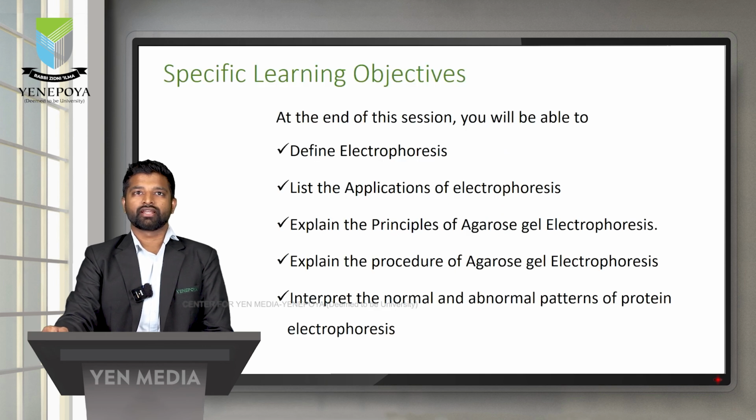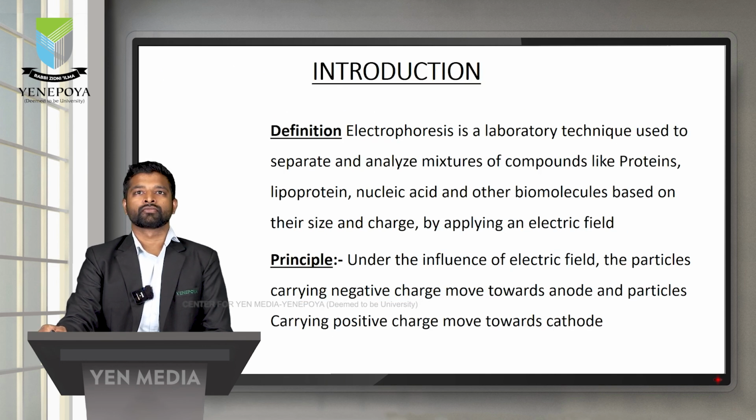So today, at the end of the session, you will be able to define electrophoresis, list out the applications of electrophoresis, explain the principle and procedure of Agarose Gel Electrophoresis, and interpret the normal and abnormal patterns of electrophoresis.